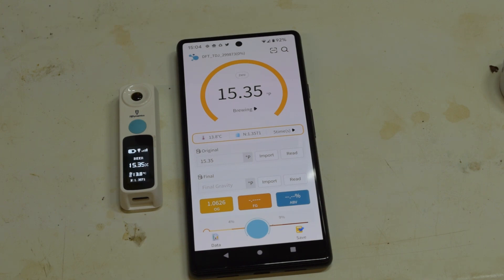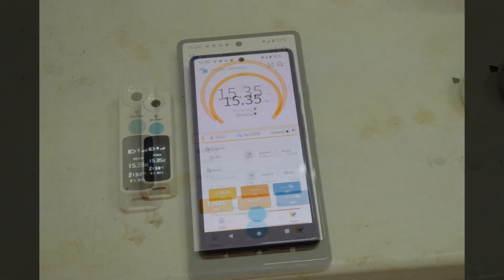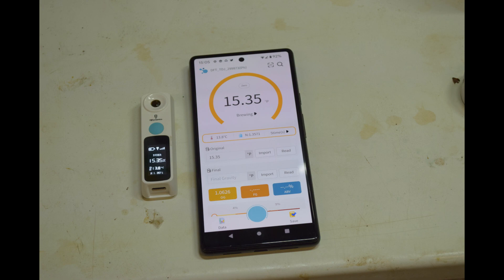The device has a lot of modes. As well as beer it can do coffee and fruit and many other things. Personally I've only tried it for beer and to get total dissolved solids in coffee just out of interest, and it seems to work well in both cases.